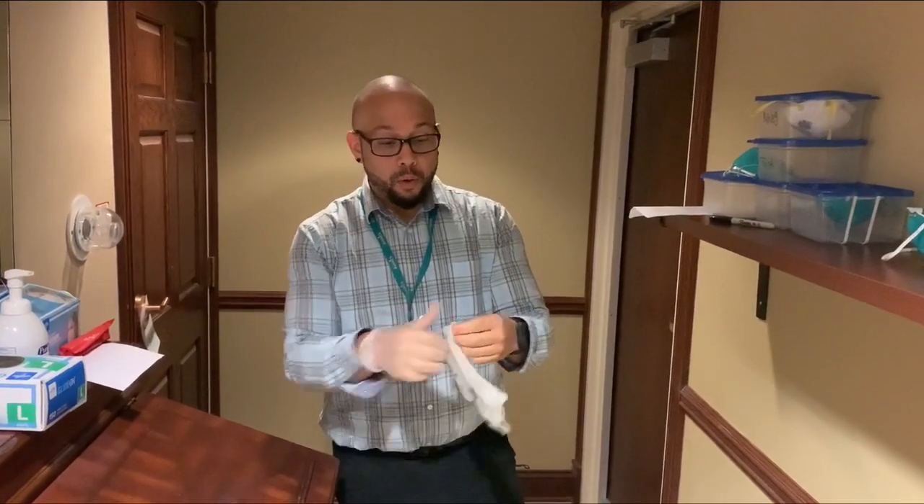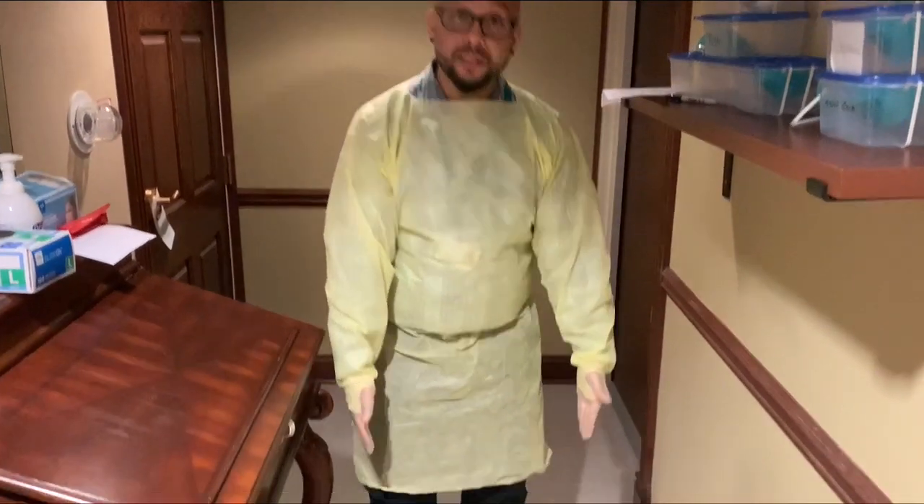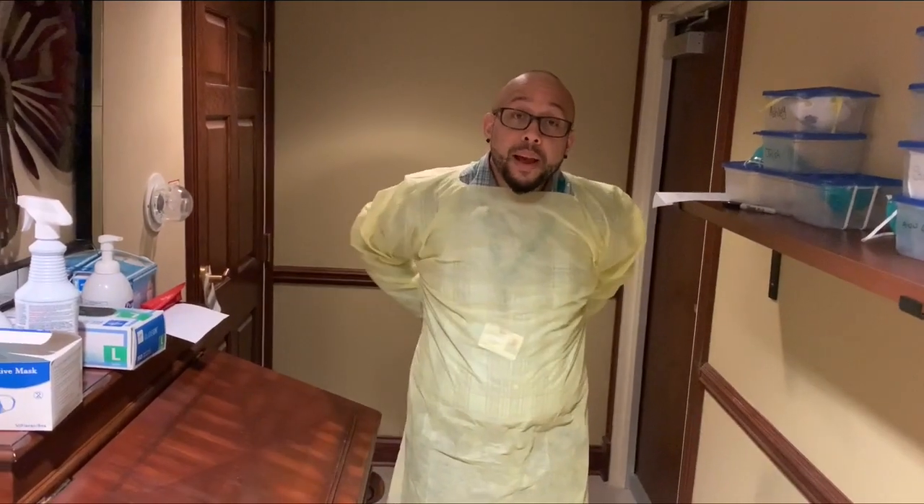First, put on gloves — one of two pairs. After the gloves, we put on our gown. We put it on, covering our torso from our neck to our knees. Next, we make sure the sleeves are covered from your arm to your wrist. If there are gowns that have thumb holes, insert your thumb through the holes. Then we reach around and tie our gowns closed.